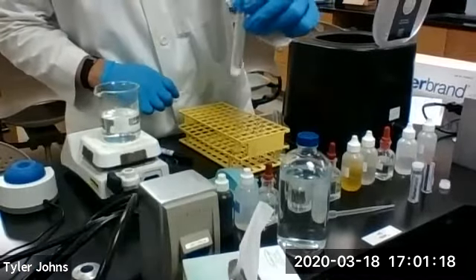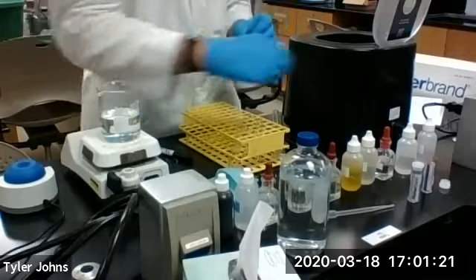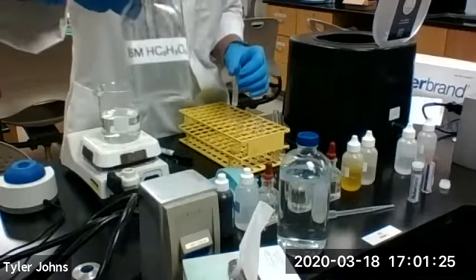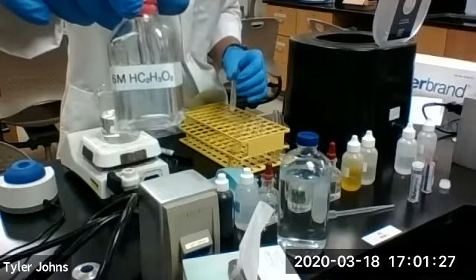So to our residue 14, R14, we are now going to add 5 drops of 6 molar acetic acid.